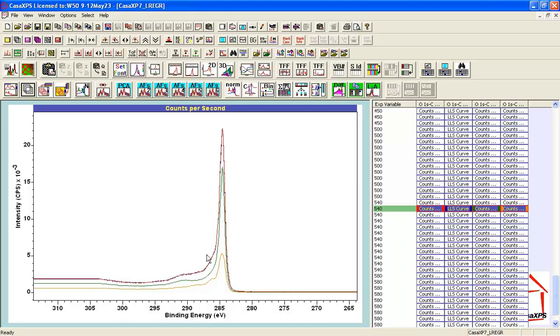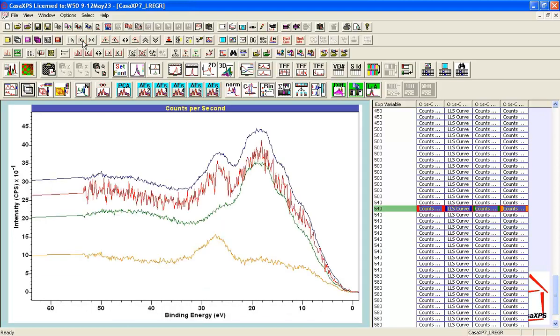That's not to say these are genuine spectra from which we can fully understand the chemistry — they may or may not be. Their function at this point is to understand what shapes are required to construct a peak model out of bell-shaped curves. Looking at these individual component curves, I can make inferences about what shapes are required within each curve. The caveat is that the valence band fit is not great — but this is plausible because the valence band was measured at pass energy 40 whereas the oxygen and carbon were measured at pass energy 20.